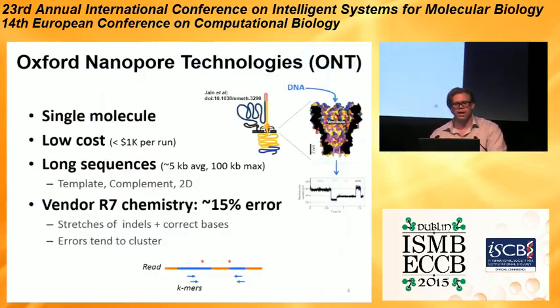Just briefly, one slide on nanopore sequencing. For those who don't know, this is not commercially ready yet, but it's in an early access phase. We've mostly worked with public data, so all that I'm going to show today is taken from public databases. This is a shift in sequencing paradigm. It's no longer sequencing by synthesis. Instead, you have a molecule, you force it through a pore, a disturbance in current is read, and a base call is determined. It's low cost.